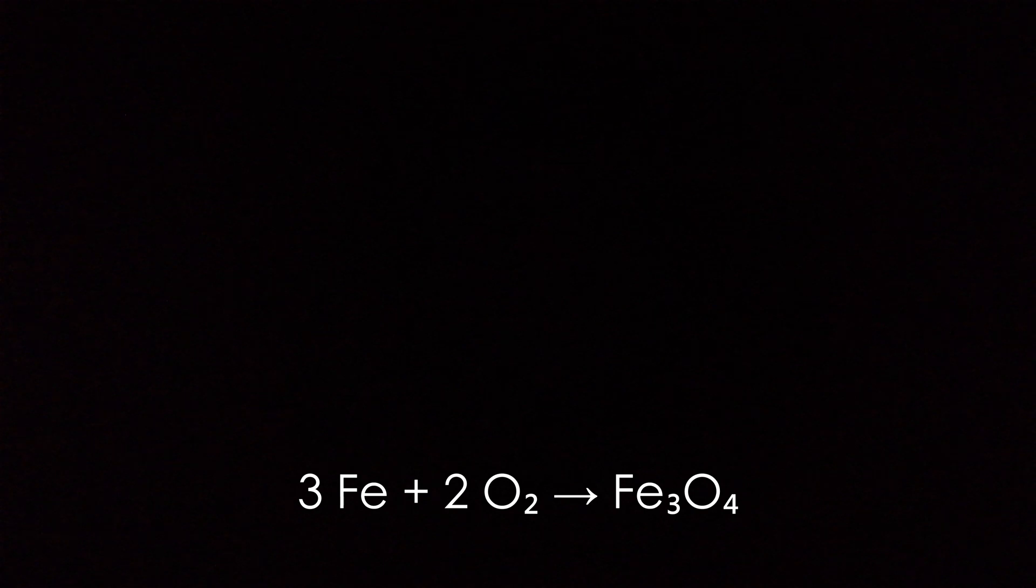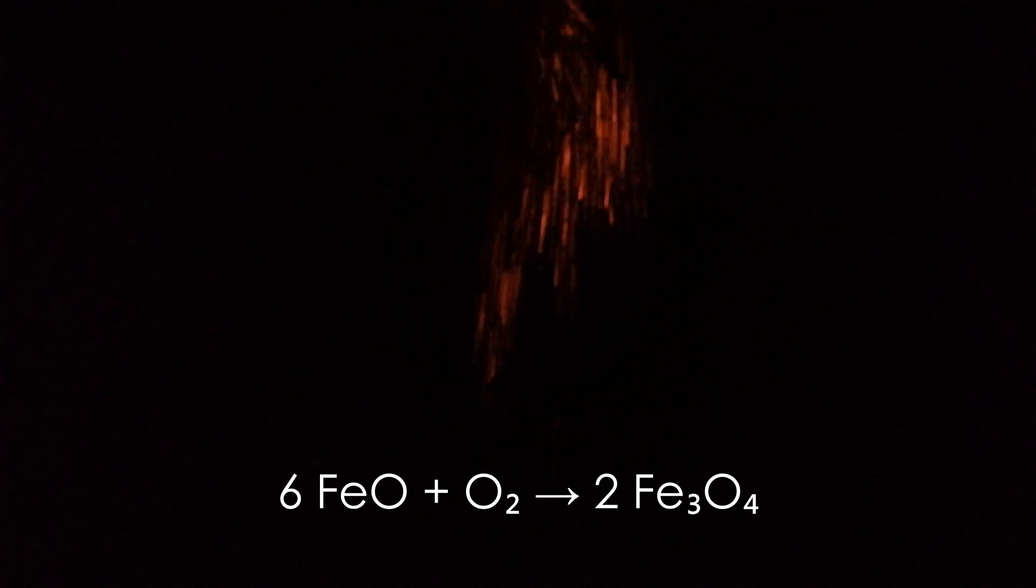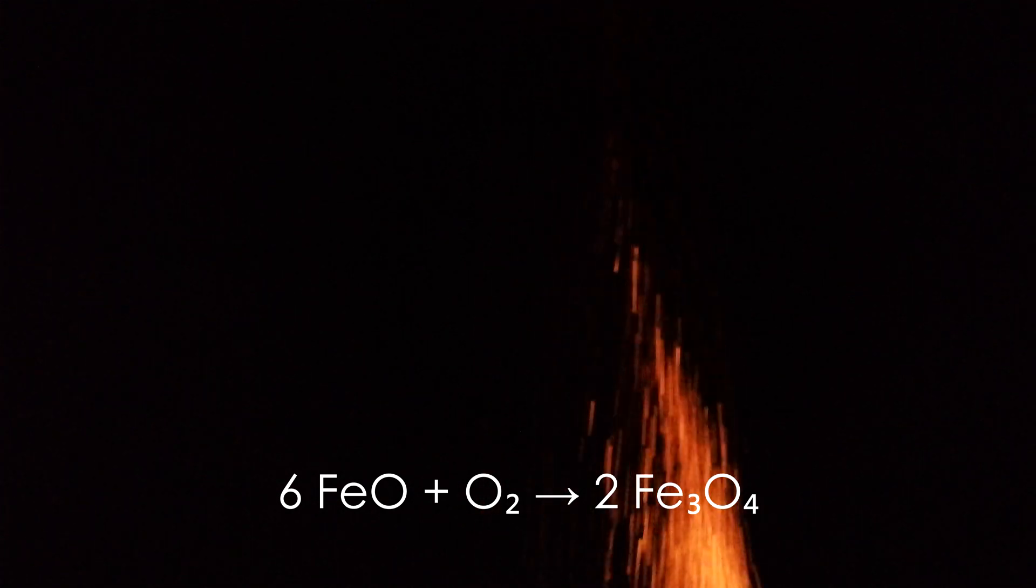If we dump out our pyrophoric iron from a small height, it will form a nice shower of sparks. Upon contact with air, particles of pyrophoric iron immediately combust, forming magnetite. If there is any ferrous oxide present, it is also oxidized to magnetite.